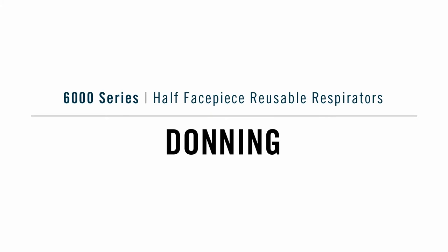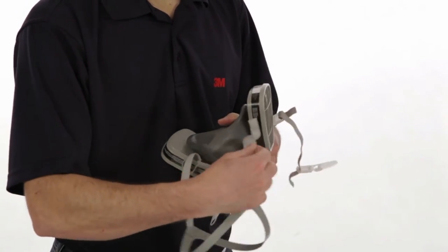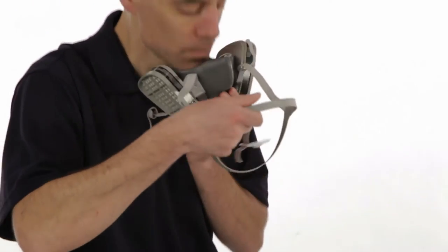Donning 6000. Before you put on your respirator, make sure the straps are pulled far enough through the buckles to permit easy adjustment.